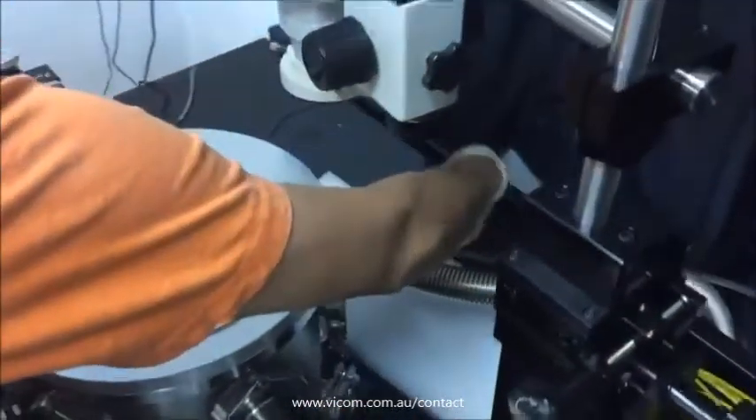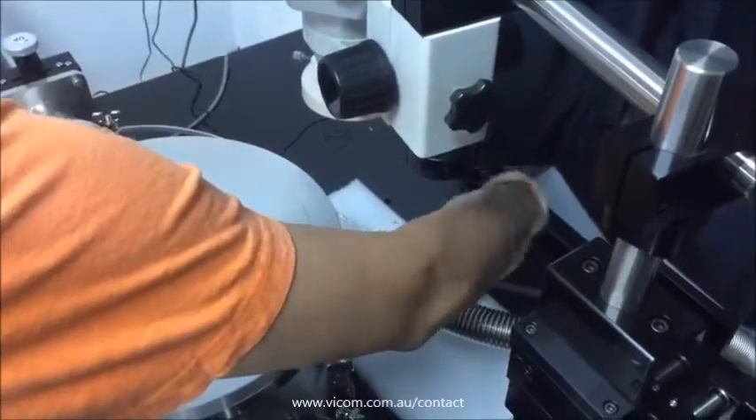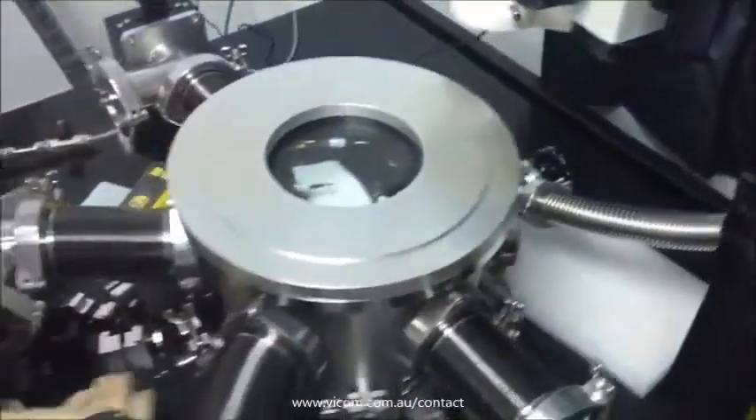Next, I will introduce the process of how to turn off the station after finishing the measurement. Close the broken isolation valve and open the knob for outgassing the chamber, allowing the pressure to return to air.